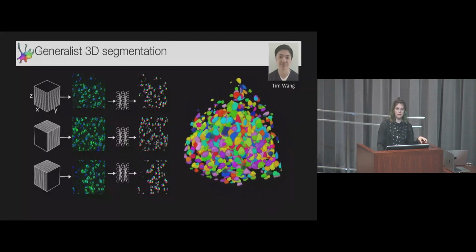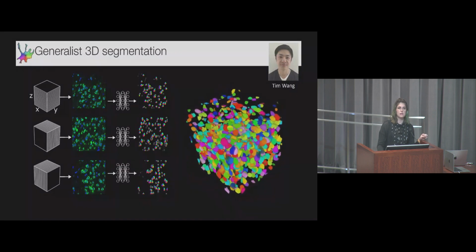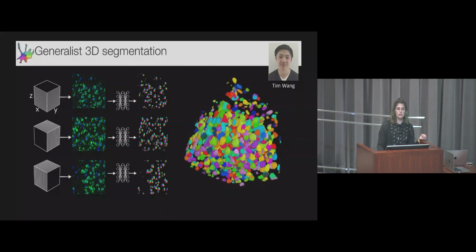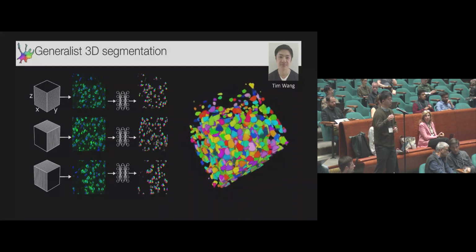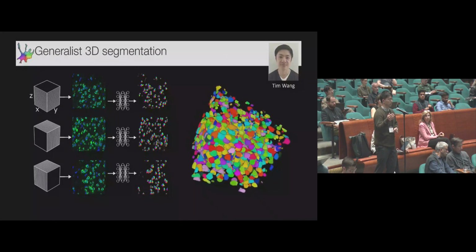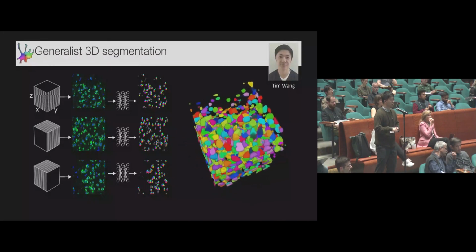And we find that works quite well in most cases when things are not super complicated in terms of shape. So a chaser question. If you're imaging, like with most optical microscopy setups, I guess the Z resolution is way worse than XY. So in that case, basically, do I have to downsample the XY? No.